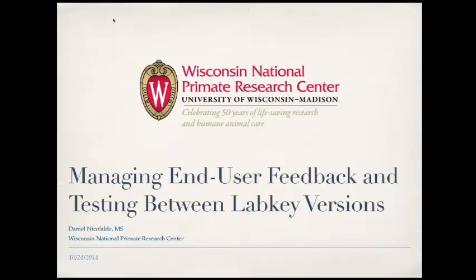The staff in the center use this on a regular basis to upload data, to decide on treatments, to search for animals. Basically they use the system on a day-to-day basis, and they cannot do their job if the system is not up. So one of my roles is, with every version of LabKey, to make sure it works, that everything we use works the way it was planned.